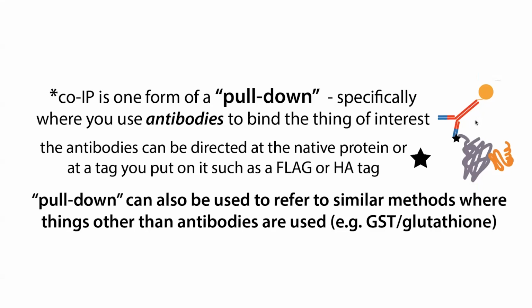So all of that was dealing with the IP and the co-IP, where we're dealing with immunoprecipitation, so using an antibody. But the exact same principles pretty much hold true for the protocol for the pull down, where you bind, you wash, and you elute, but binding based on a different property. So this often also involves genetic manipulation.